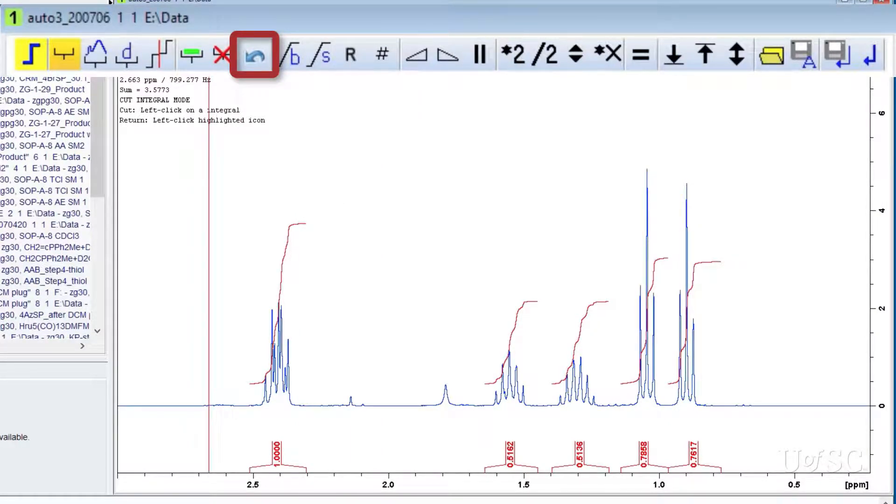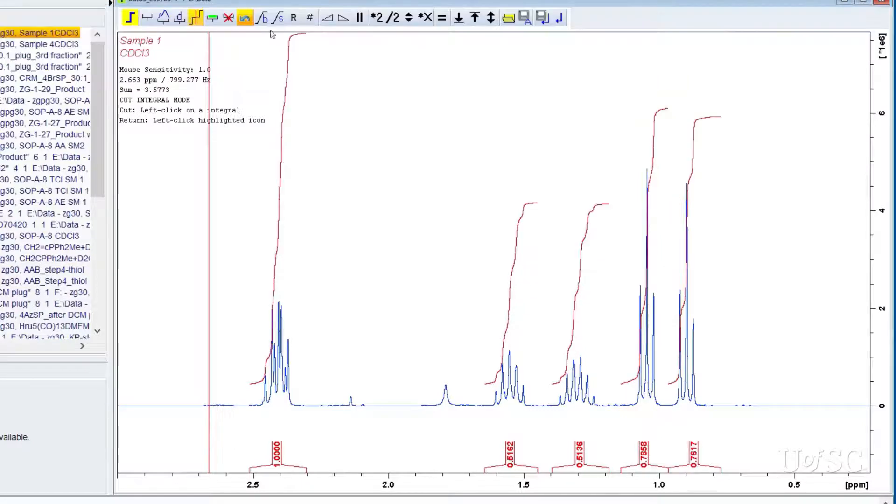When you are happy with the regions you created, you can now define the values of the regions. Notice that when you create regions from scratch, the first region is set to 1. To define a region to a set value, move the red cursor onto that region and click the right mouse button.